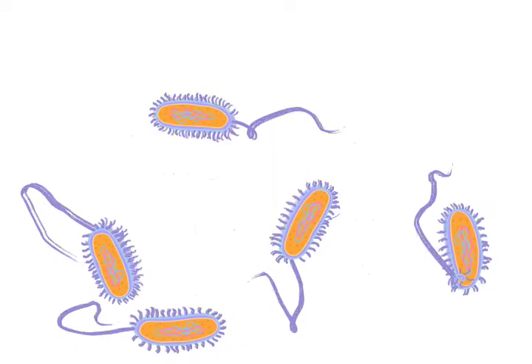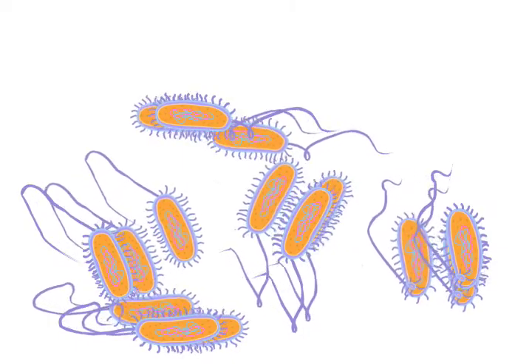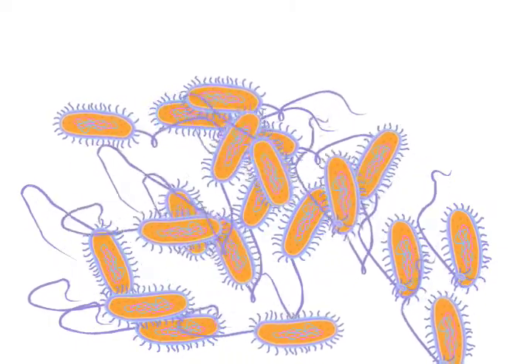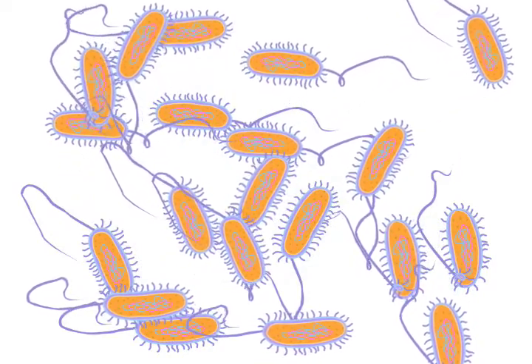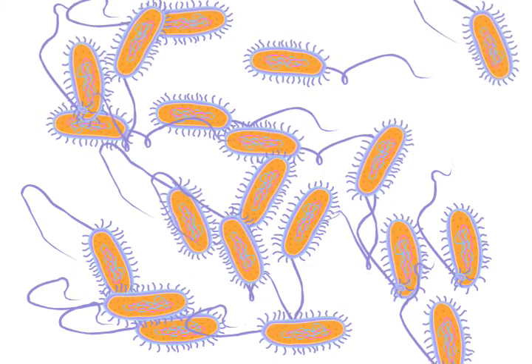Before you start the lab, the bacteria have already been transformed with a plasmid that is coded for fluorescent proteins. The bacteria have fluorescent proteins in each cell and they have multiplied.